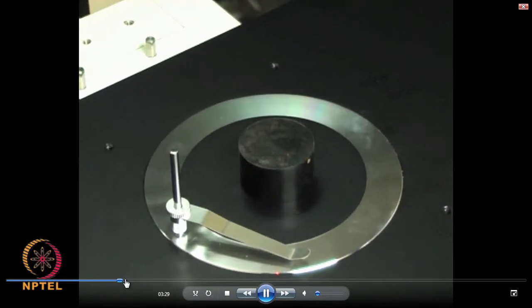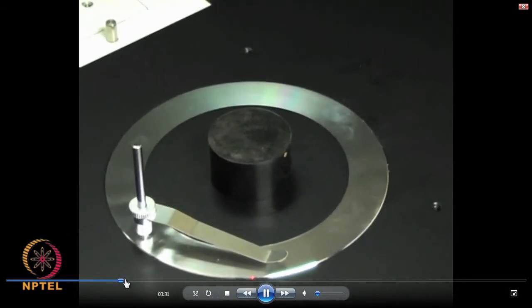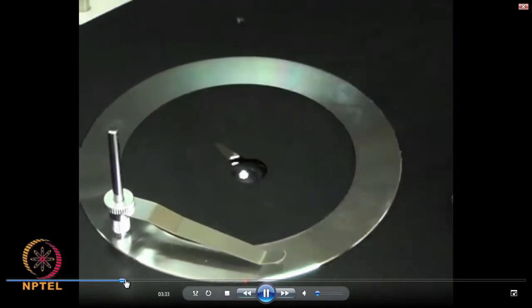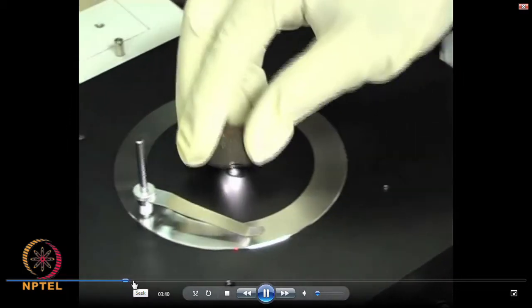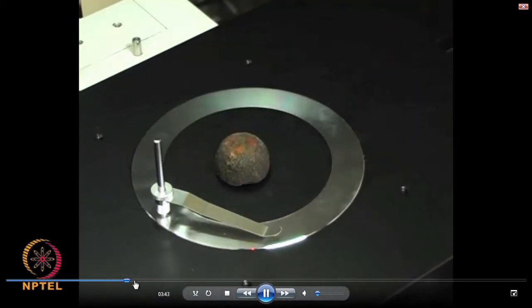Since it is a reflection microscope, and as I said, it is for opaque samples, we will see how the bright field microstructure appears.